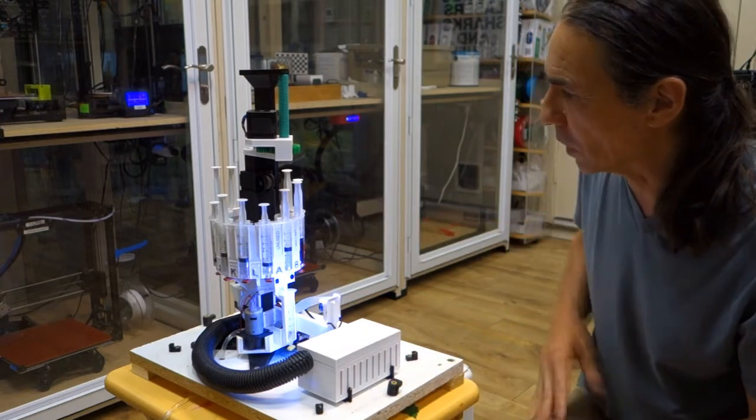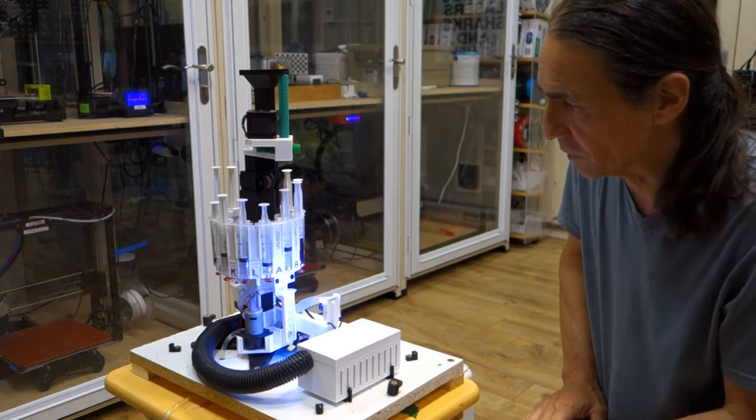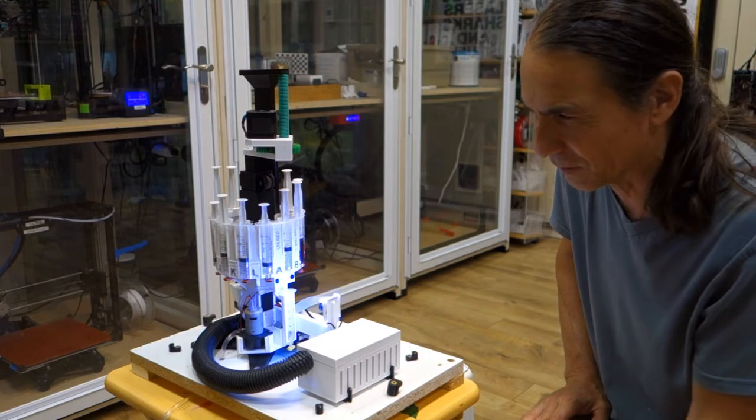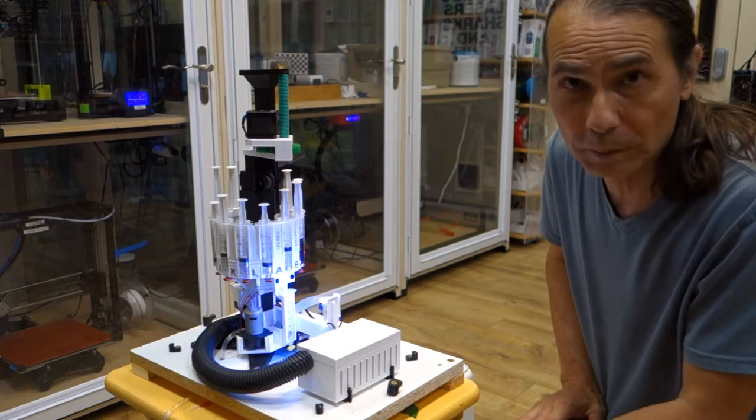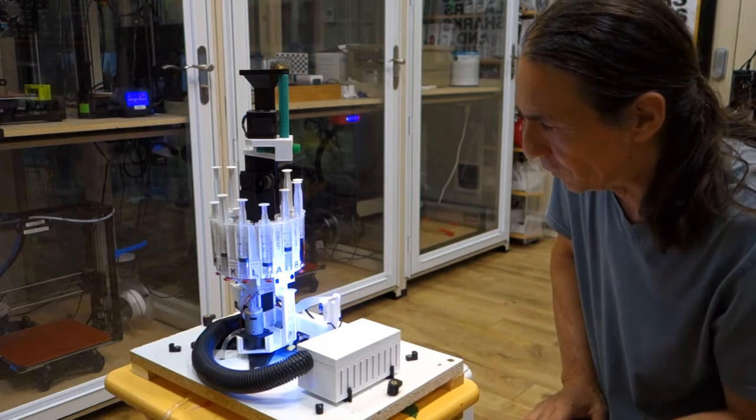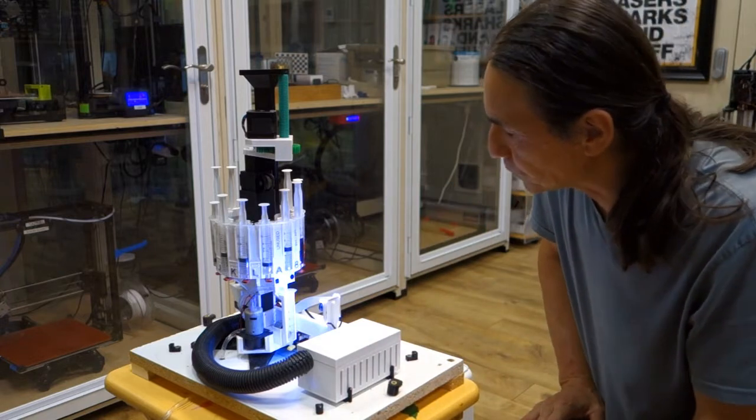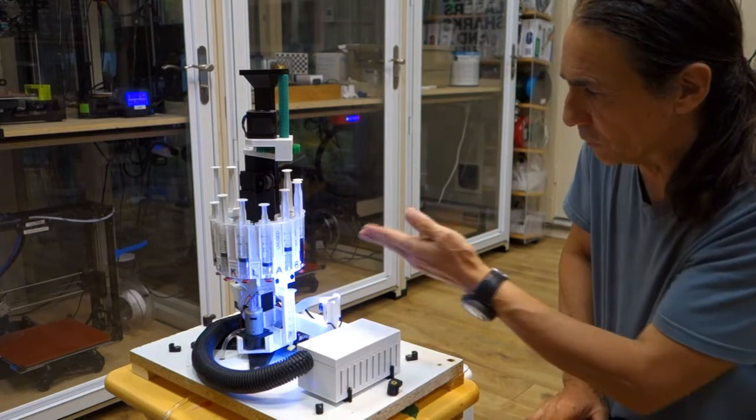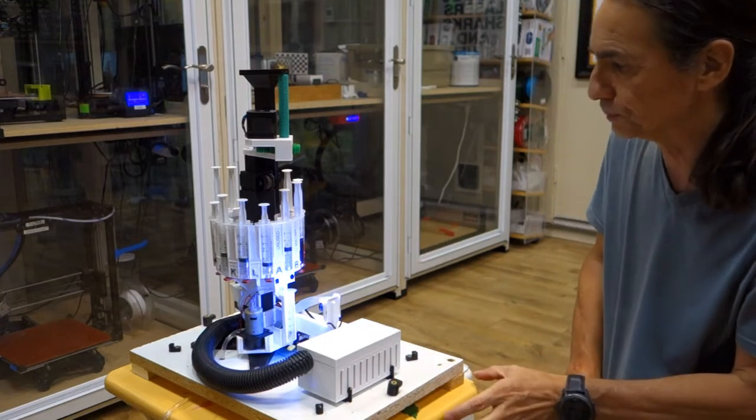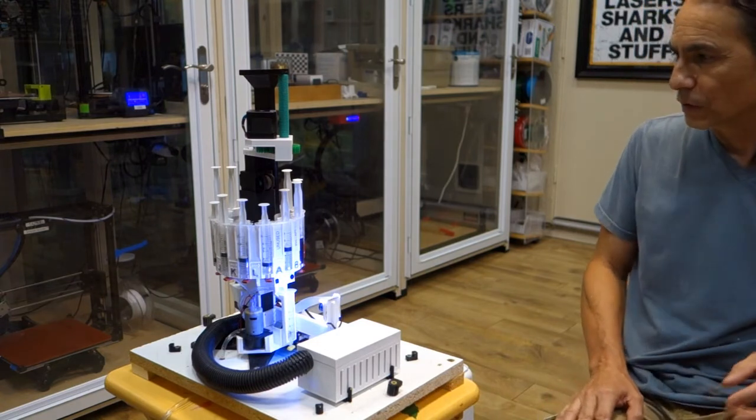The syringes are also available on Amazon. They're simple plastic, 10 milliliter syringes that you can buy. I think 100 of them for $18. No needles are included or anything. And they are what the reagent fits in and also the mixing tube.